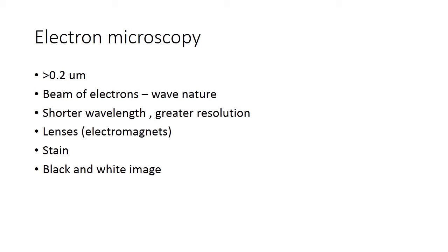However, by using image analysis software, image modifying software, we can impart colors to different regions of the specimen. Those colors are a result of image processing. Those are not the actual colors of the image which is produced through electron microscopy.